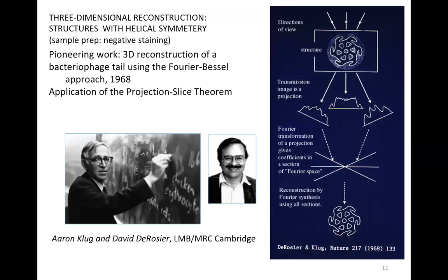So one of the effective ways of averaging is, of course, the averaging over molecules that are forming a crystal. So again, we are back to crystals here.